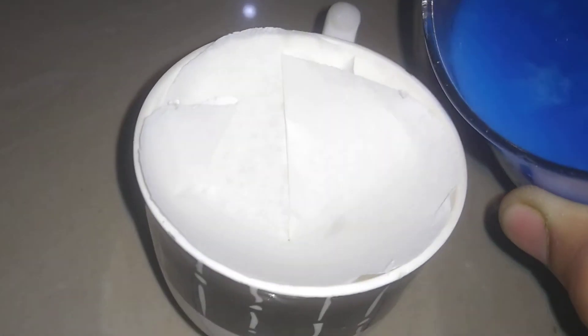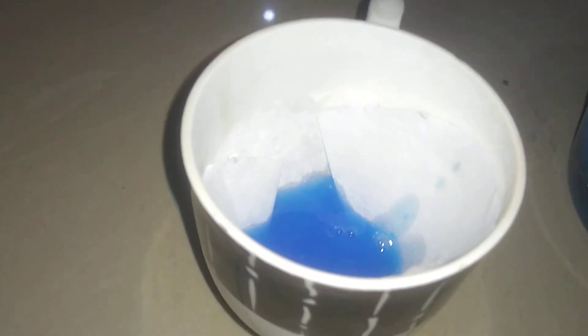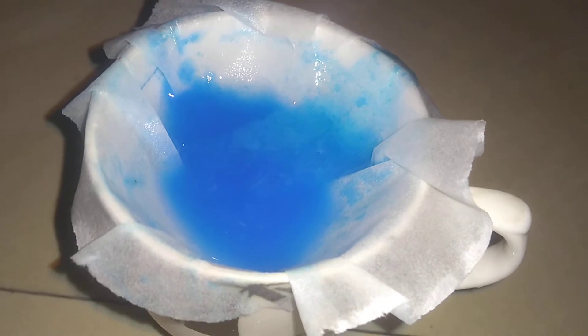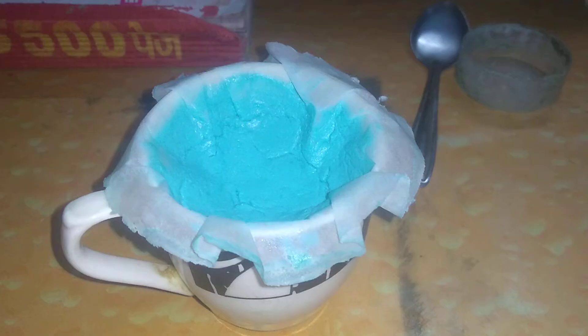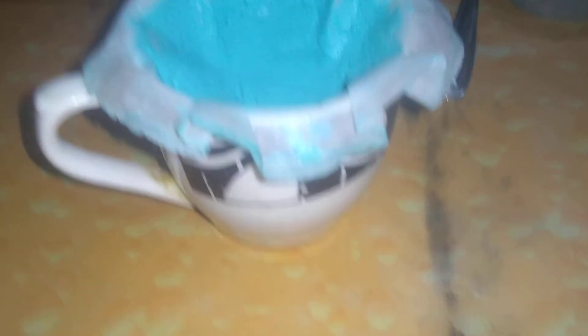Let's go ahead and slowly add this so that we can get nice filtering. We're going to be continuously adding a little bit of it inside and waiting until we have all the precipitate filtered.